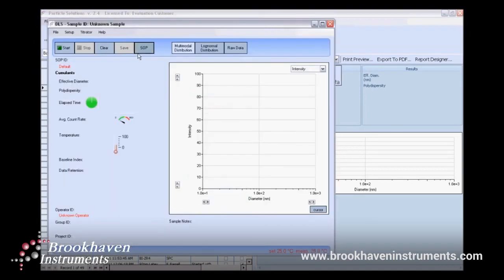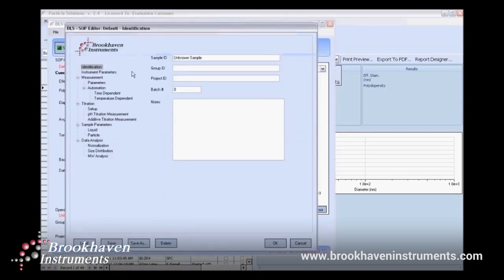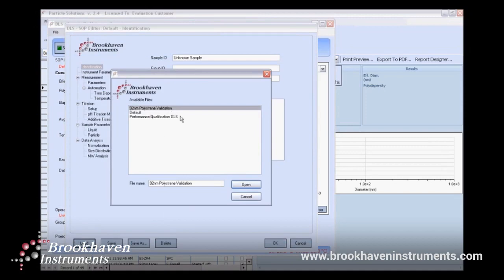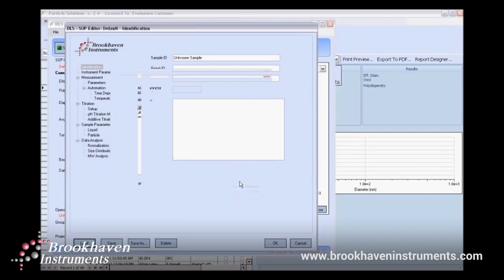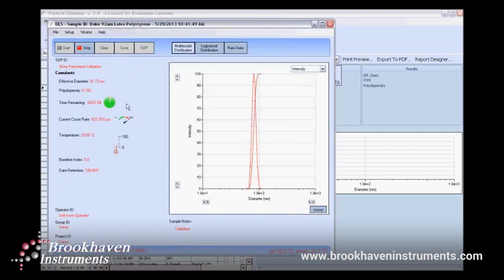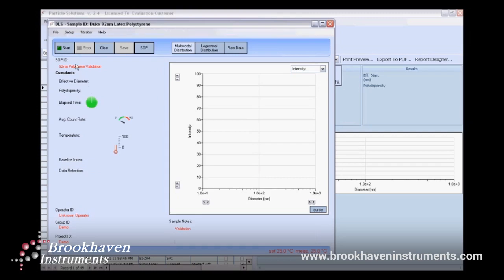Since validating the instrument can be a fairly routine procedure, I have an SOP already saved in Particle Solutions. I'll load the SOP by clicking Load and selecting my 92 nanometer polystyrene validation from the file list. Click OK to return to the measurement applet window.